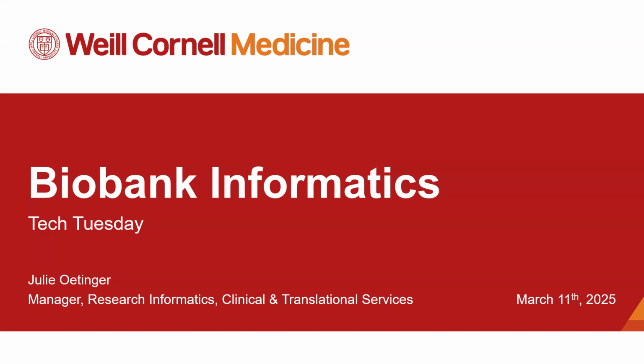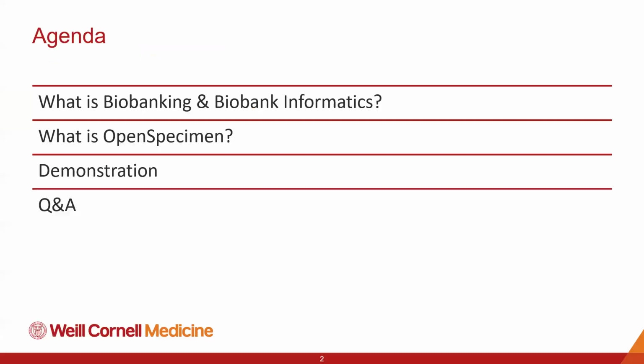So today's topic is biobank informatics. During today's session, I'm hoping you'll gather a bit more about what biobanking and biobank informatics really is. Then we're going to take a deep dive into what OpenSpecimen is. You'll hear more about that in a little bit, and then we'll dive right into a demonstration of the OpenSpecimen application, and also have some time for some Q&A at the end. All right, so let's jump right in.